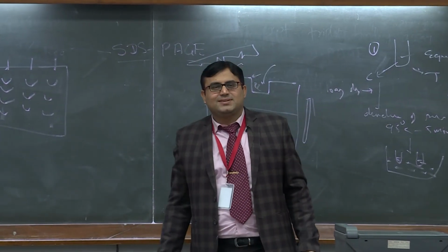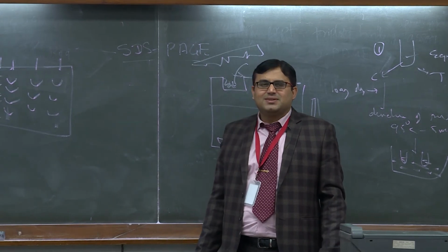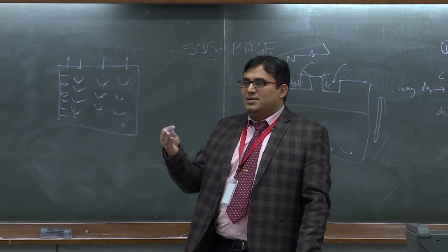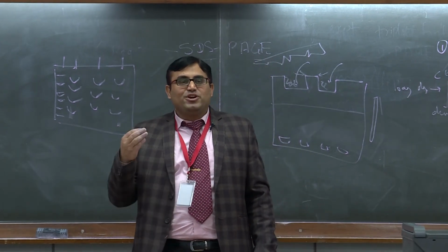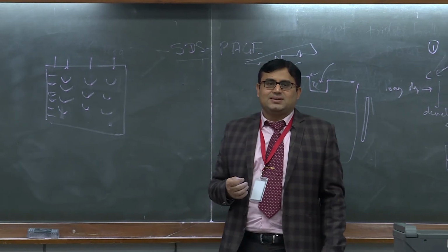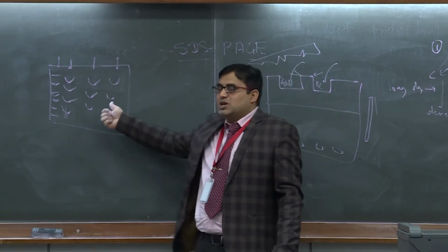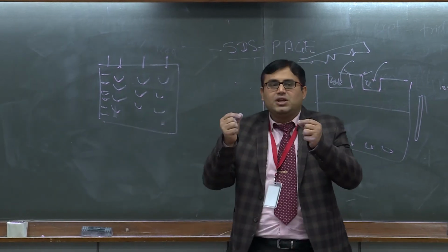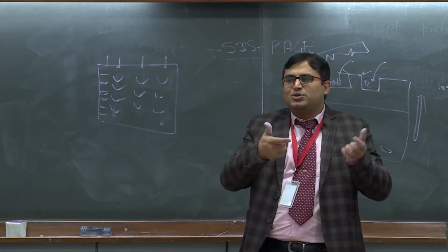What happens? Exactly. The voltage which was expected, you have used more than what was expected. And the outcome of such type of run is, many times you have seen when you take the plate out, it will be broken and you will be surprised how it happens.